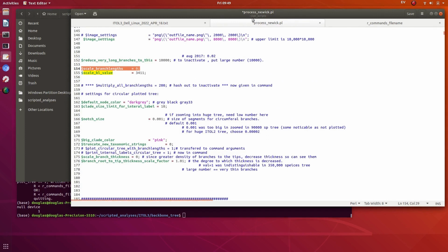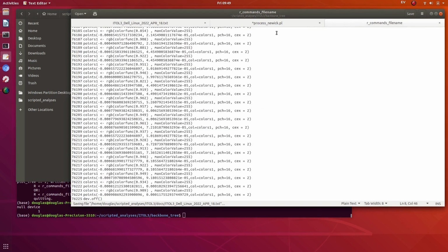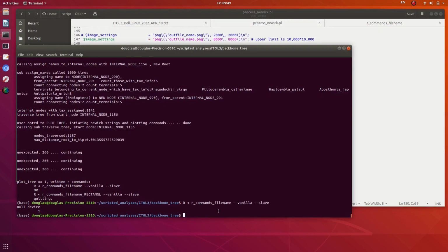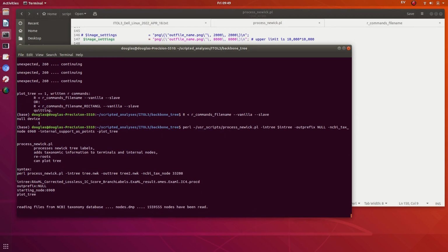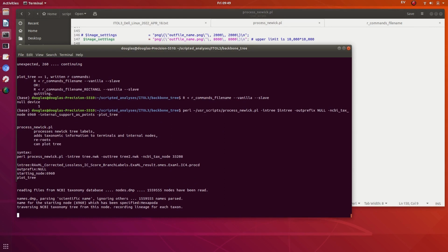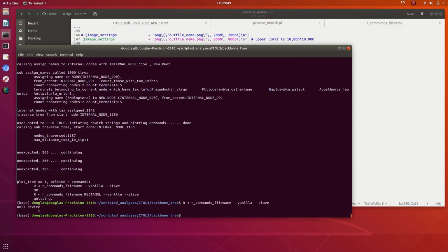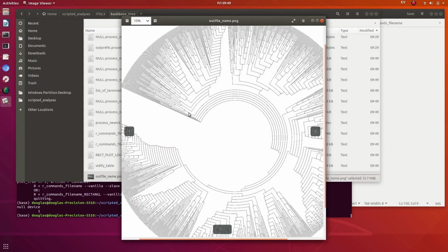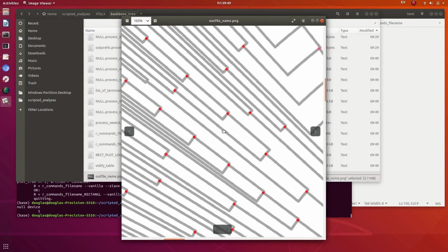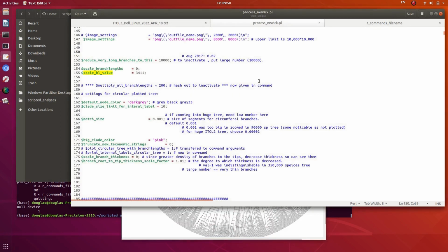I think it's this. Okay, so we have, yep, let's plot these a bit bigger first thing.